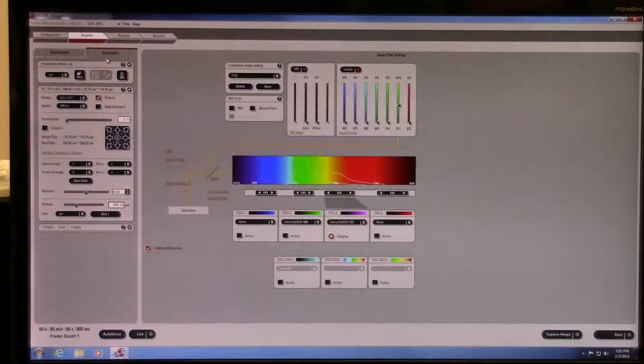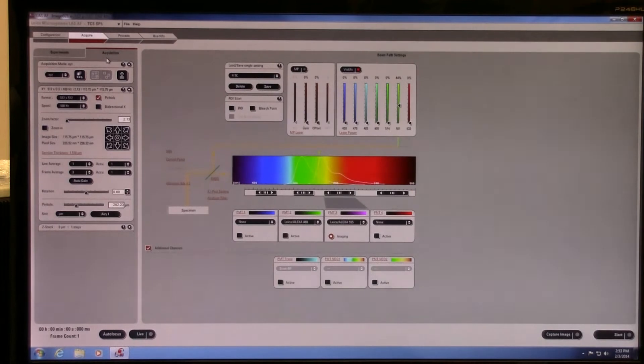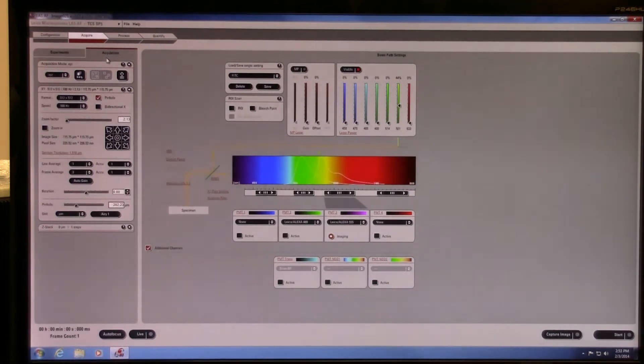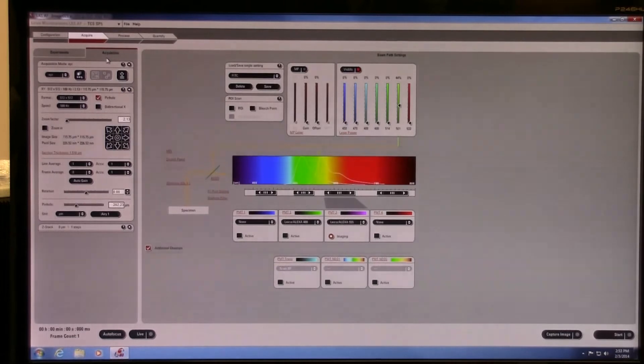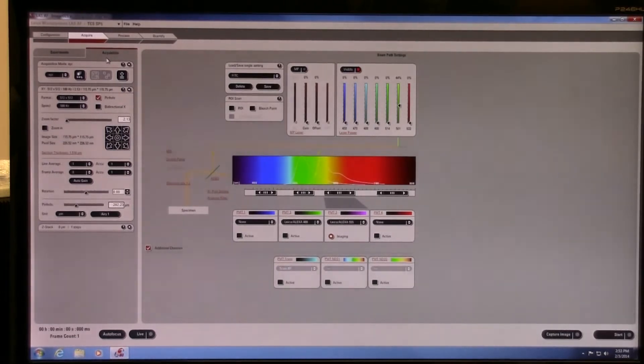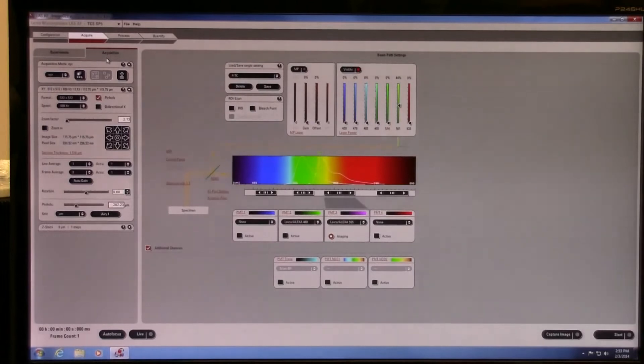This module on the SP5 Leica confocal training is in addition to the basic module, which you should have seen prior to this. This is a module for multi-color imaging of a sample.